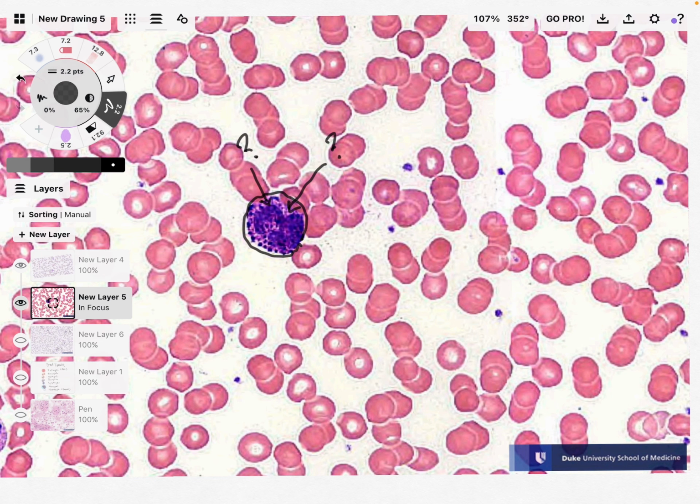Eosinophils, aside from the nucleus, really do not stain with the hematoxylin. Only the nucleus of the eosinophil is really going to be staining in a distinguishable way with the hematoxylin. But this clearly has some granules that are staining really dark, especially on the periphery here, close to the plasma membrane, and even throughout, you can see lots of these dark stains. This one has these basophilic vesicles that stain with the hematoxylin. So this one, therefore, is definitely a basophil.